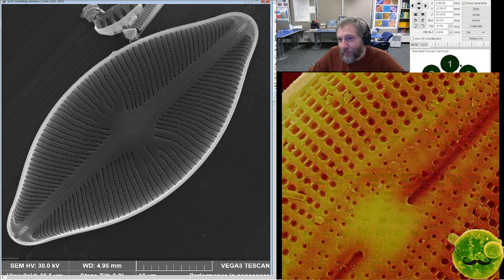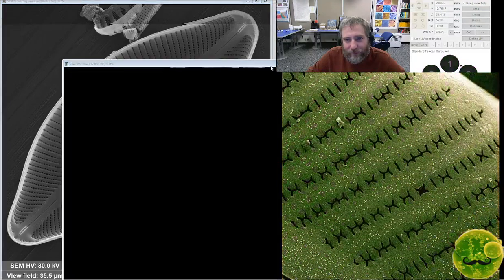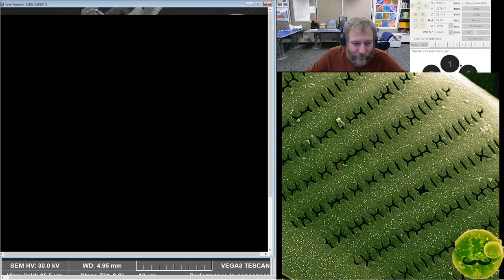All right, beam intensity can go down to 7, and it's looking real sharp. Okay, I'll take that picture. And I don't speak German or read German, so.